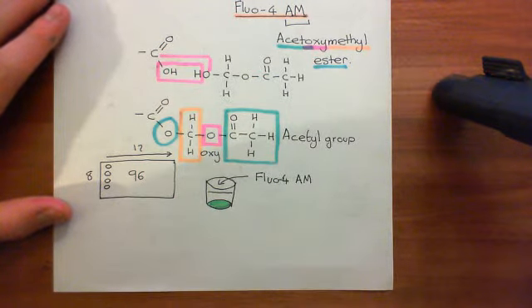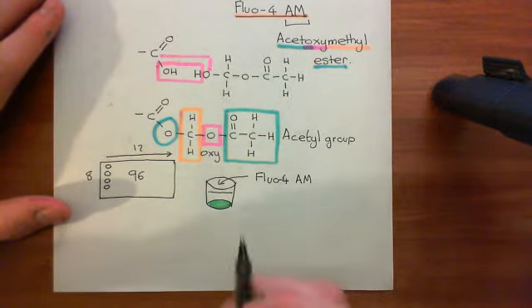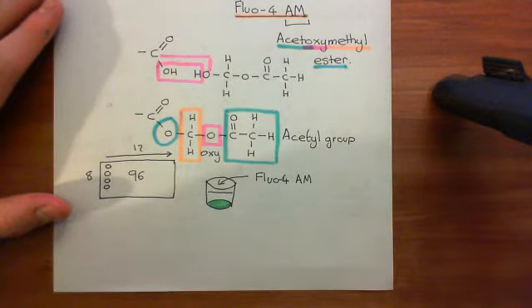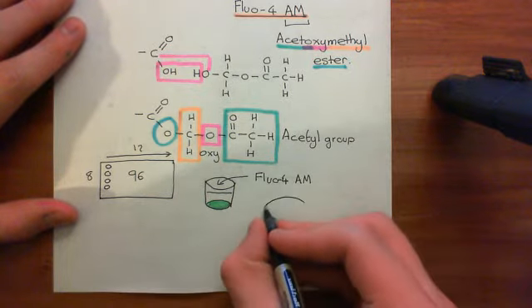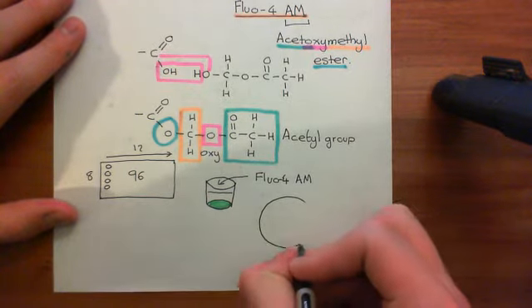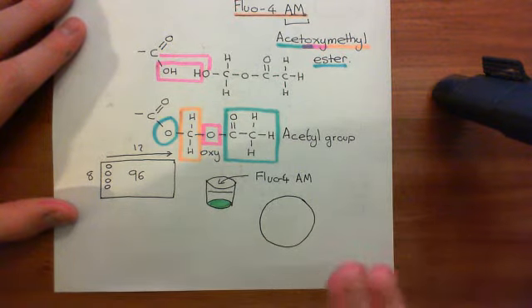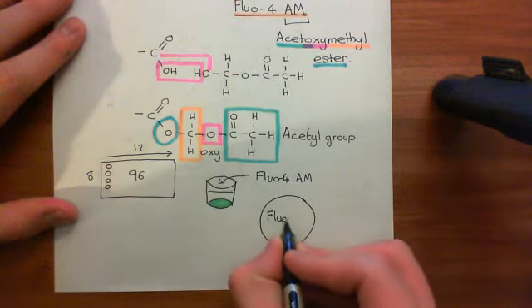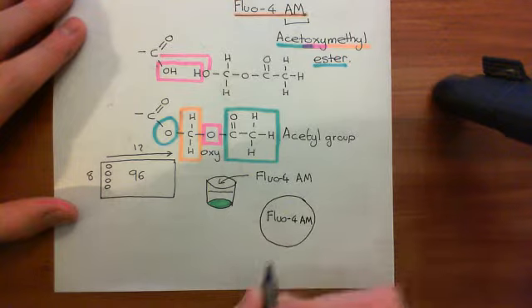Now, this is the genius part, because you might think, well, great, but hardly any Fluo-4 AM molecules are actually going to end up down there. But there is an ingenious bit. Basically, Fluo-4 AM molecules go into cells, but they never come out of them again, and let me explain the reason why. So in comes the Fluo-4 AM molecule into the cells.